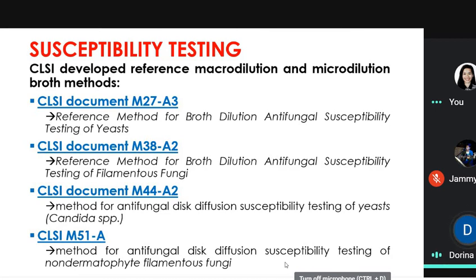Okay, inoculation. So you inoculate mo siya sa iyong plate, 'di ba? And then, dapat makakreate ka ng lawn of the microorganism. And then, after na inoculate mo yung iyong bacteria, anong next gagawin mo? Wala yung antibiotic disk? Ja.